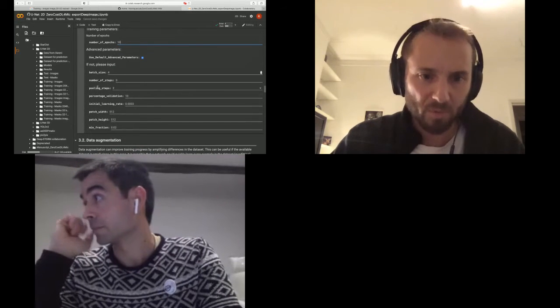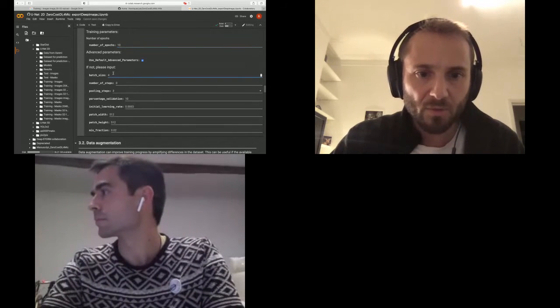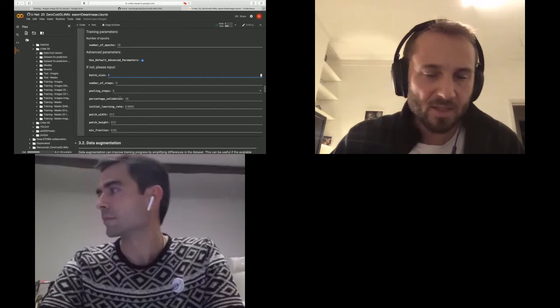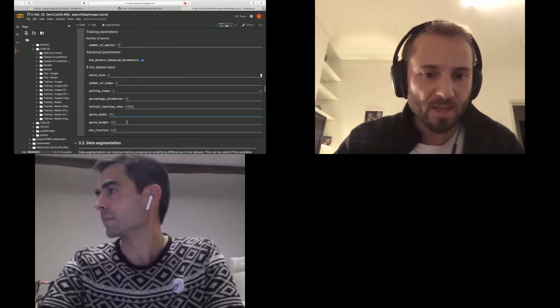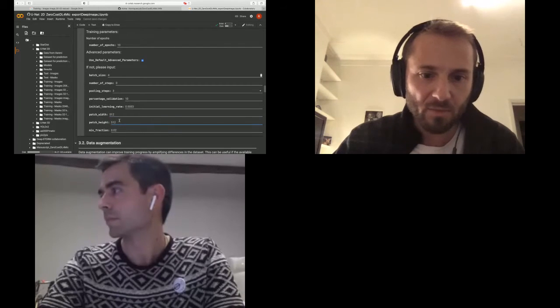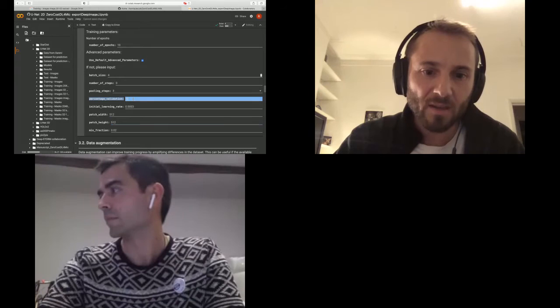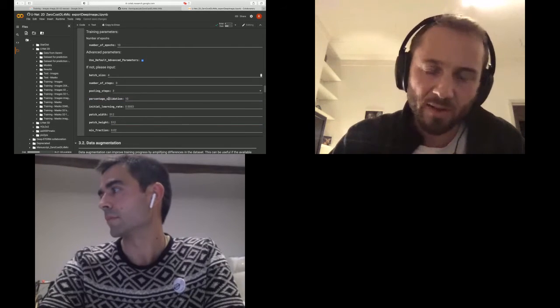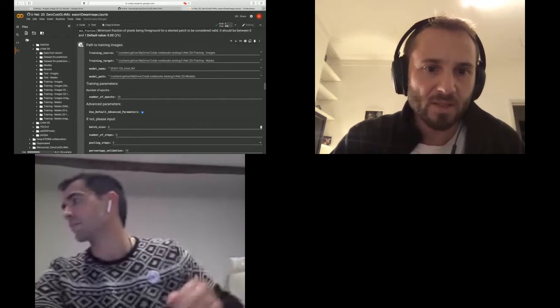And there's a bunch of advanced parameters that we probably don't need to worry too much about today. For those of you who have tested a little bit of deep learning, there are parameters such as batch size, how many bits of images you'll feed at any one step of the iterative process, the size of the bits of the images, and also how much of your data you set aside for validation, right? And that's also important, in light of the validation that Ignacio also mentioned to us earlier. So let's just set those parameters.